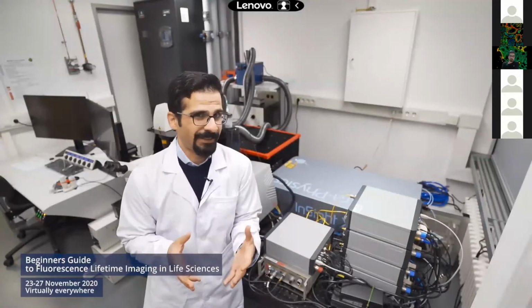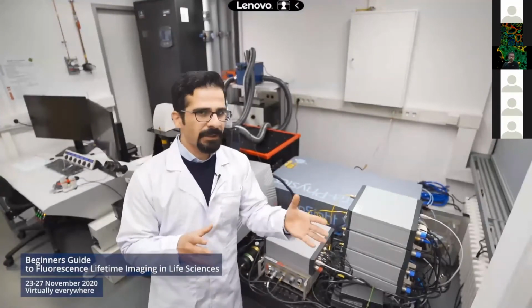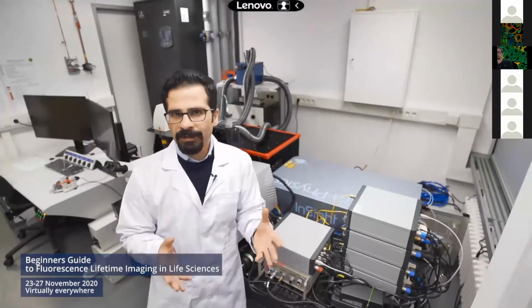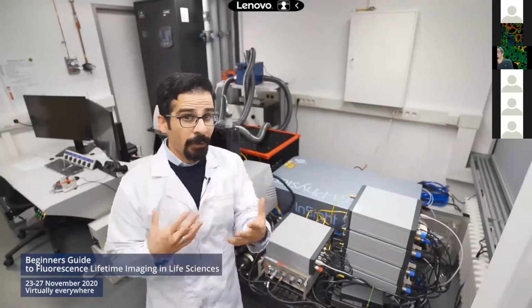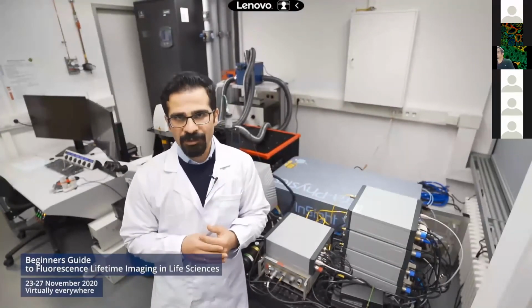It's actually a strong laser, you see. And the other one is a tunable line, which you can tune from 680 nanometer to 1300 nanometer. The average output at 900 nanometer is about 2 watts. This enables us to do simultaneous multi-channel multi-photon imaging.